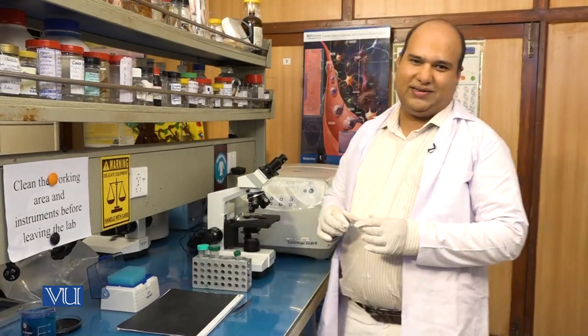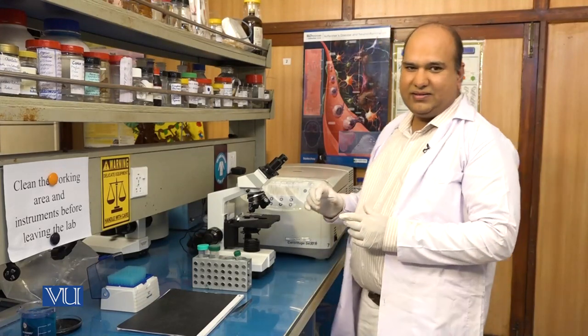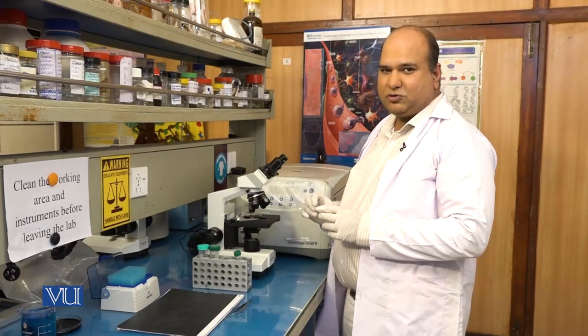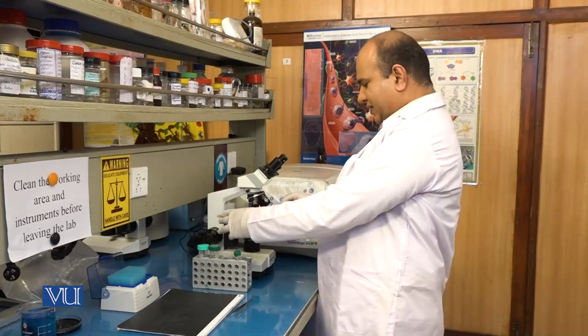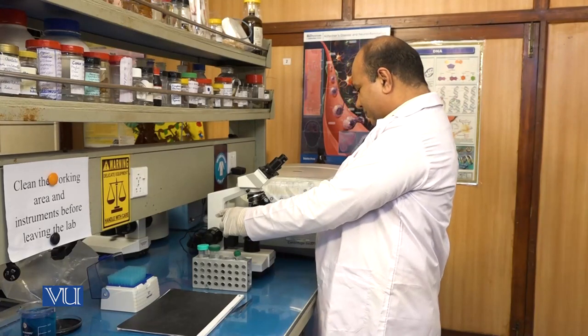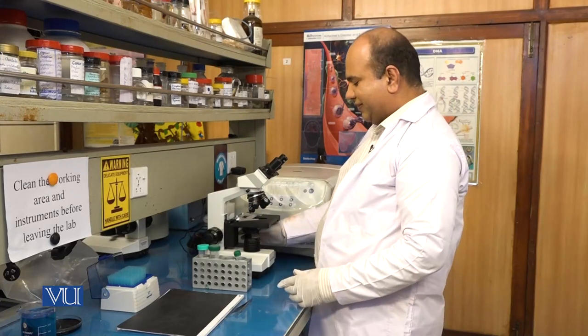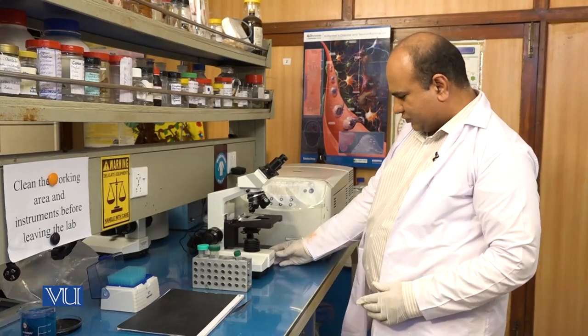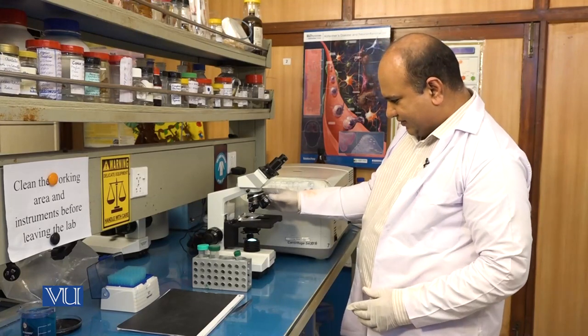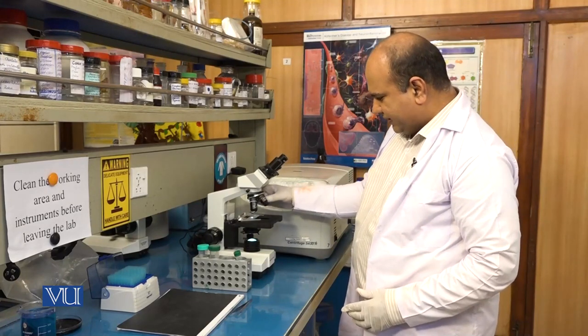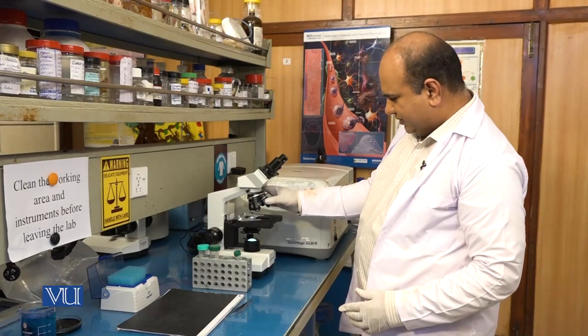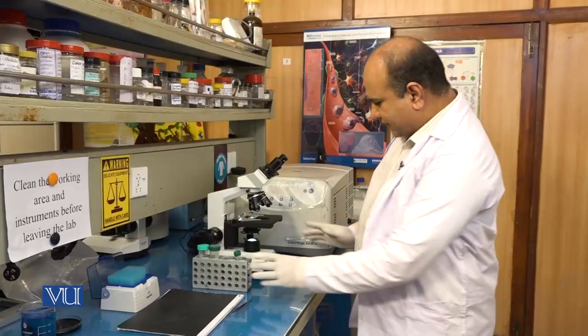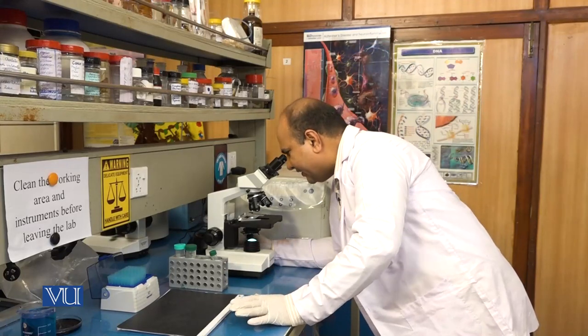Okay guys, now let us see the final results of our three to four days of hard work. Now we will see the chromosomes in the microscope and I'm sure we will have a very nice photograph. So this is a microscope. Let's turn on the light. Let's first do it at the magnification of 10, at 10x objective lens.